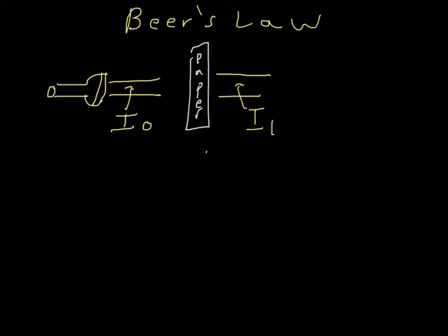is going to be, the intensity of light after the piece of paper is going to be less than the intensity of light before the sheet of paper. The paper is going to absorb some of the light or reflect it. Going to prevent it from reaching the detector. In this experiment, what's our detector? Our eye over here.